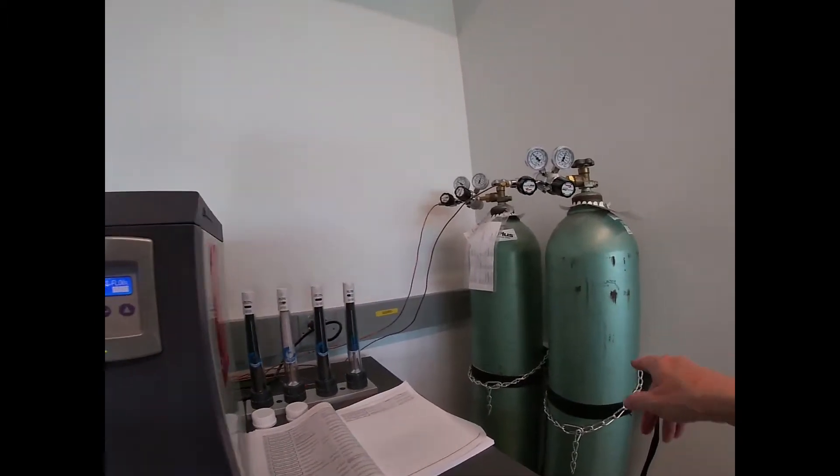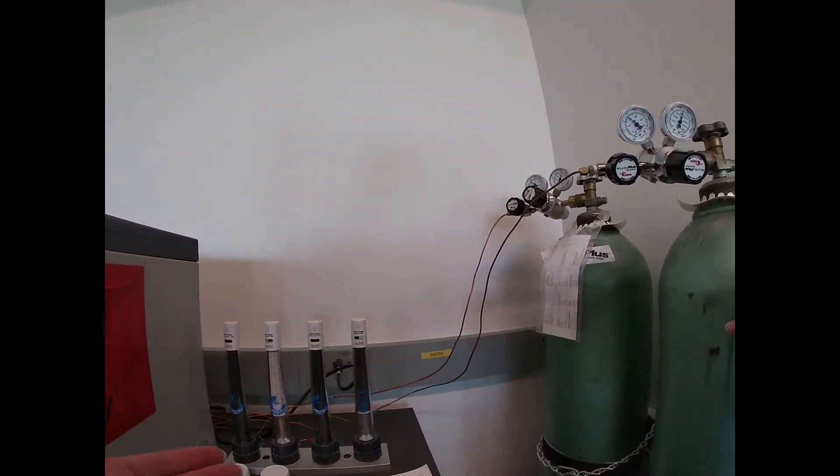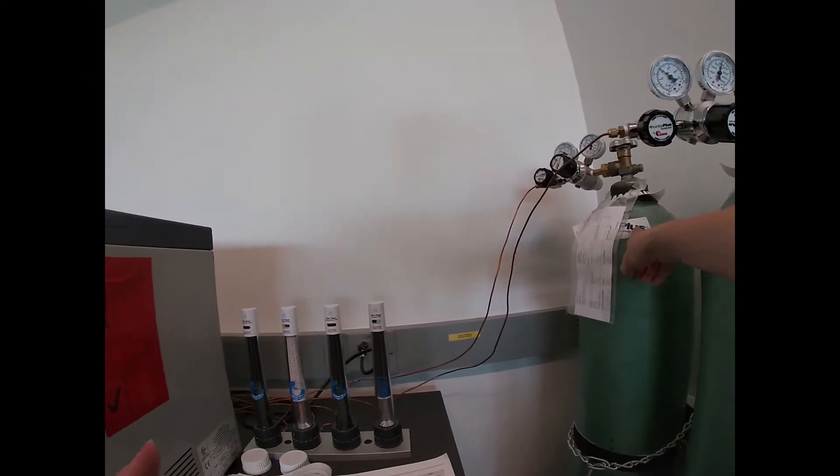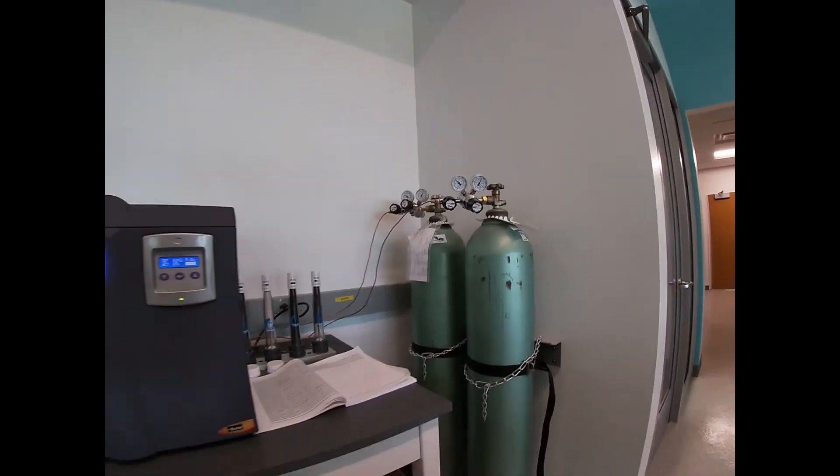And then over here we have some makeup gases. We have nitrogen, which is used as a makeup gas just for additional pressure. And then this over here is air, some high purity air that is our oxidant for our flame.